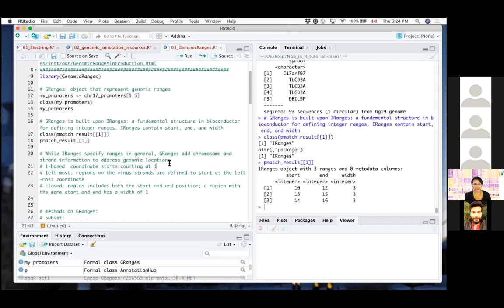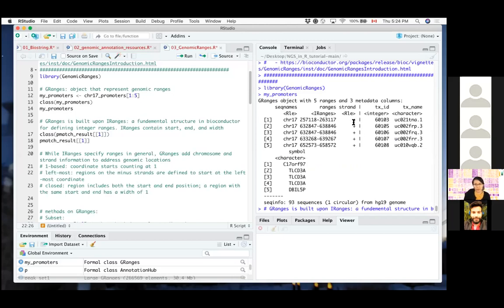Now, if you're doing analysis that requires base pair precision, you have to be aware that whether the source is one-based or zero-based, it could be all wrong if it's one off. The regions that are defined in these genomic ranges, no matter if on the positive strand or the negative strand, are always ordered by the numeric value.